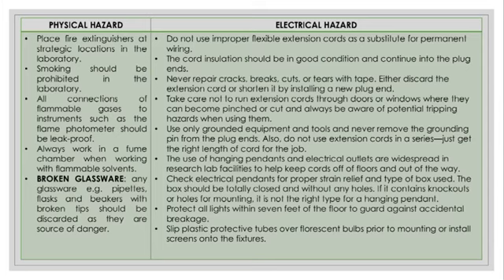So use only grounded equipment and tools and never remove the grounding pin from the plug ends. Also, do not use extension cords in a series. Just get the right length of cord for the job. And the use of hanging pendants and electrical outlets are recommended in research lab facilities to help keep cords off of floors and out of the way.